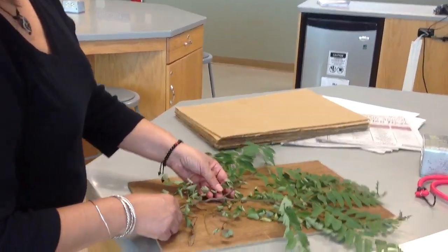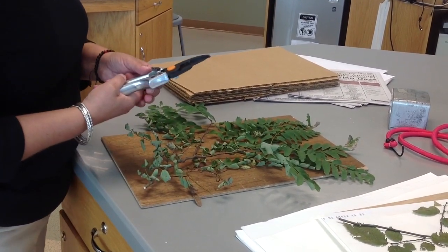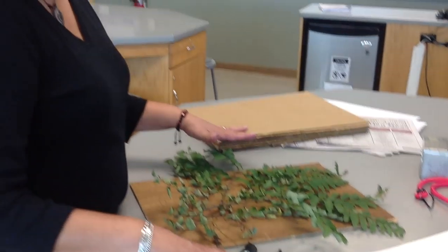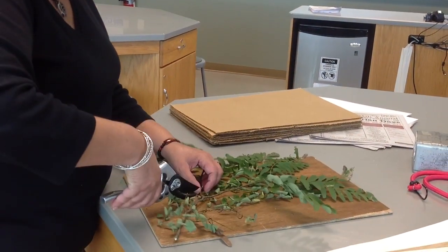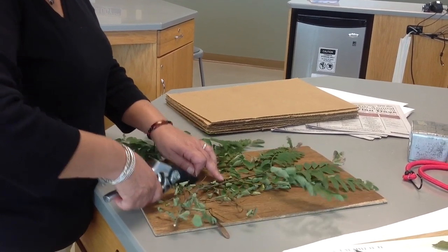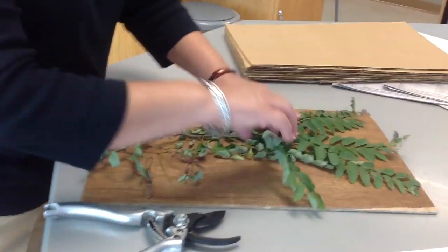If you have clippers, that's a good thing. I can see from the size of this sample that there's too much here — I'm going to have a hard time fitting this within the press. So I'm going to look at some plant material I could remove, probably cut this portion off, and that can be used elsewhere.